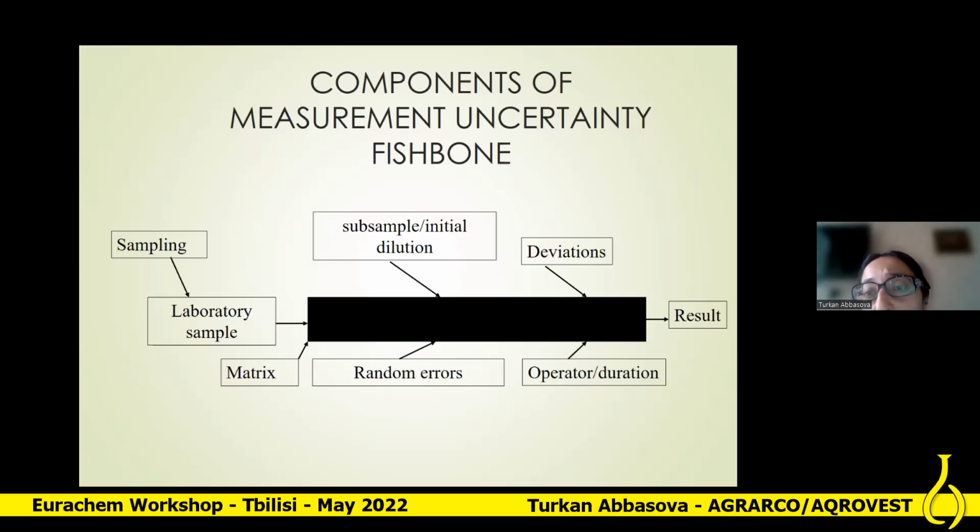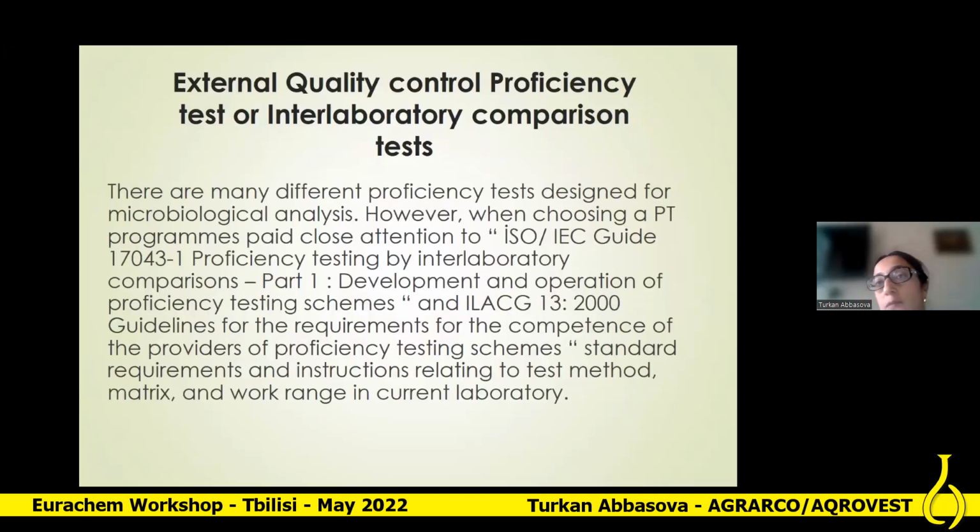And finally, the measurement uncertainty is interpreted thus: as you know, any laboratory can carry out the validation and verification processing. After the determination of the standard deviations, all of the figures should be multiplied by 2 after logarithmic 10 processing. We should multiply by 2 because K is interpreted as 2, 95% confidence.